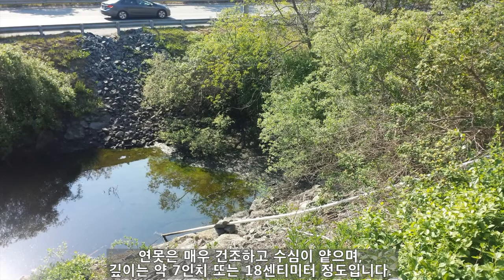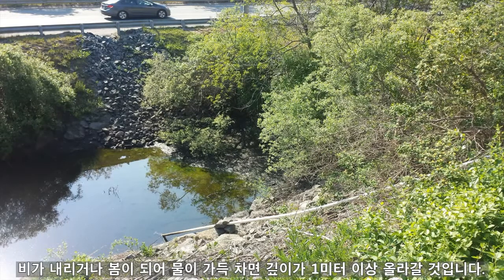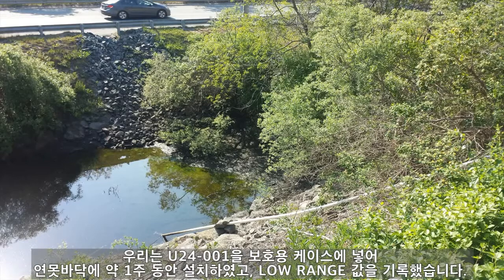Right now it's about 7 inches or 18 centimeters deep, and when it fills up, when we get rain or in the springtime, it'll go up to over 1 meter deep. So we put this U24-001 in a protective housing. We mounted it on the bottom for about a week, and we logged the low range on that conductivity logger.